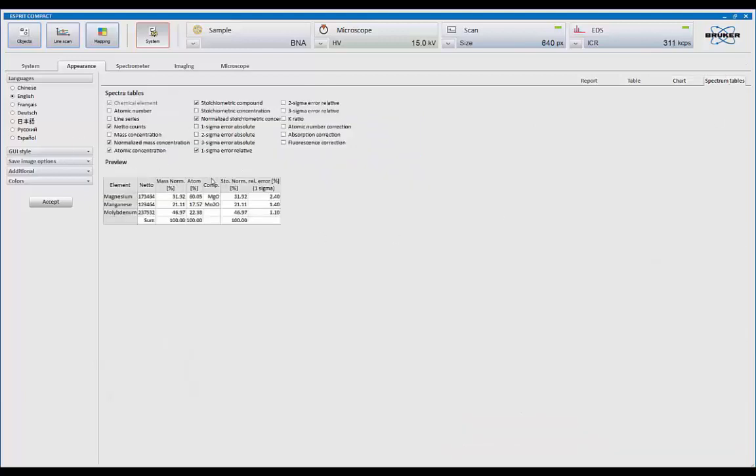And then spectrum table. This is your default for quant. So what information do you want quant to come up with. Do you want just the atomic number? You don't want the atomic number. You want the symbol, elemental symbol, or name.